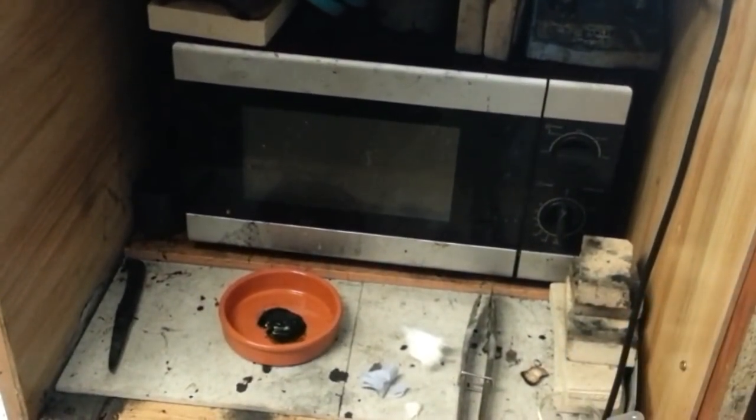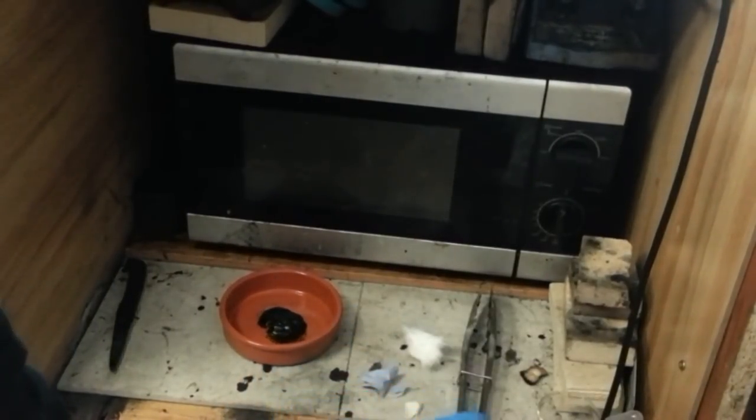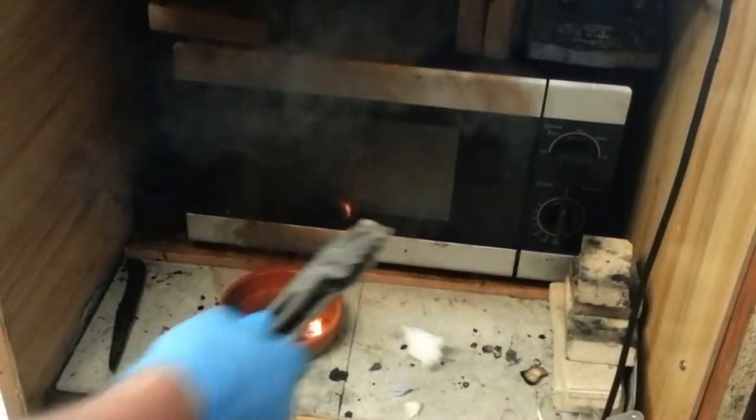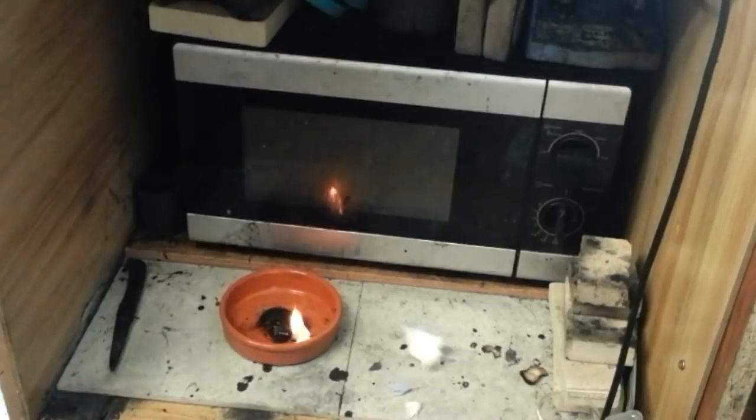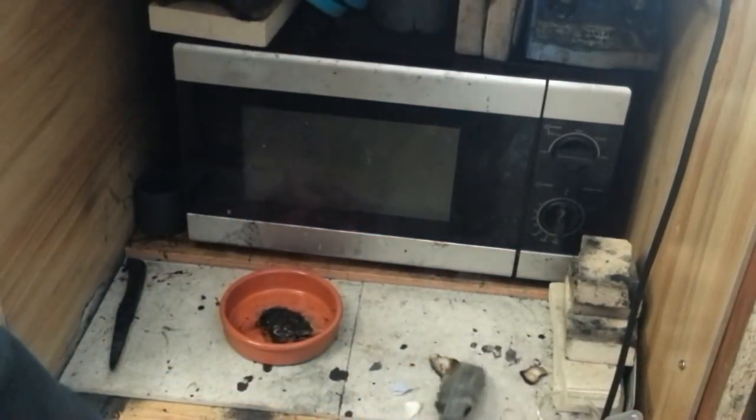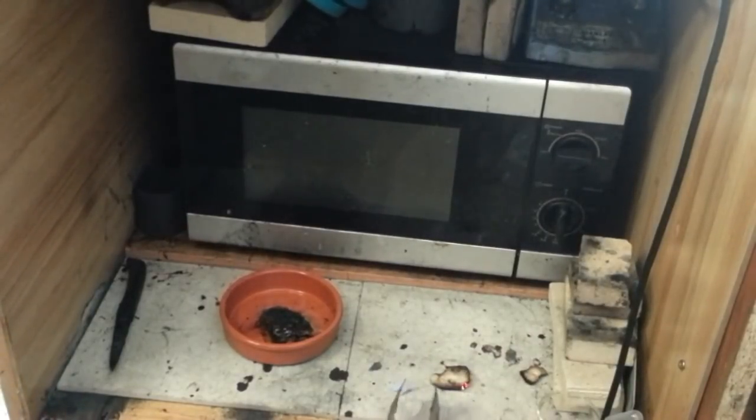I'll just show you that — okay, there it is, bubbling away and definitely turning green. I've got some organic materials here. This is a piece of tissue — it does make you jump, there's no two ways about that. That was just a piece of tissue. This is a piece of cotton wool basically.